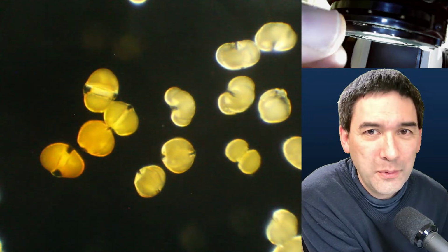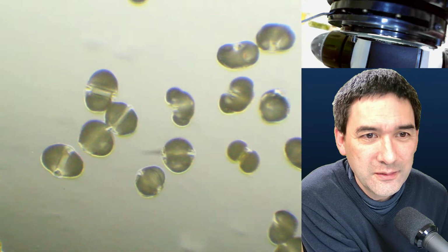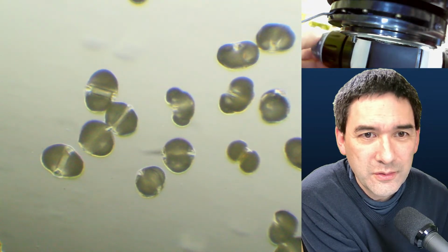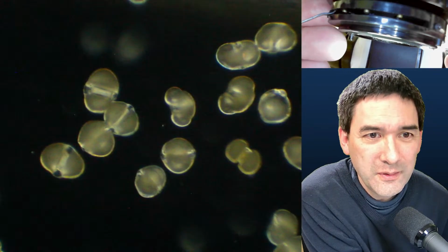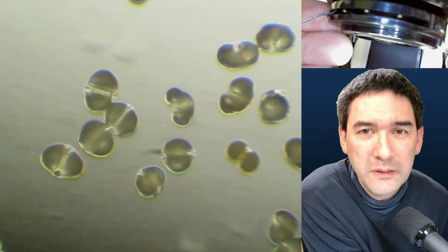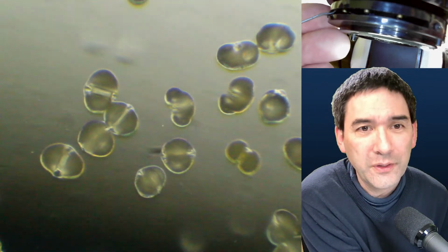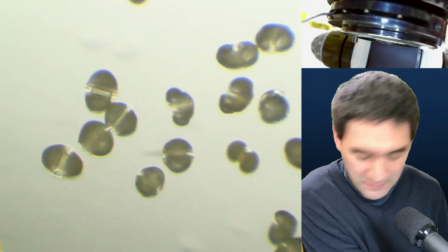Let's open this up again. It's too bright. But for the oblique effect, not quite as much. I don't get a very strong oblique effect here compared to the one for Euparal, for example. And the last one is the nail polish.